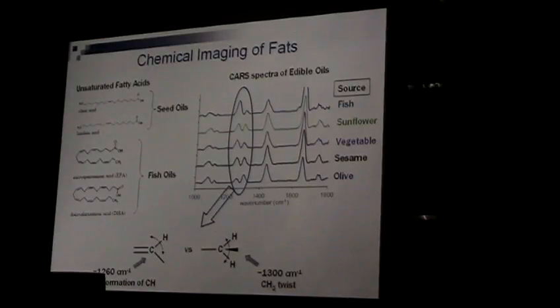What am I talking about? But there's one peak here, a double peak, right? They are the ones that change. You can see it looks like the fish oil. So this is like best fat, worst fat. Looks like this ratio keeps changing.